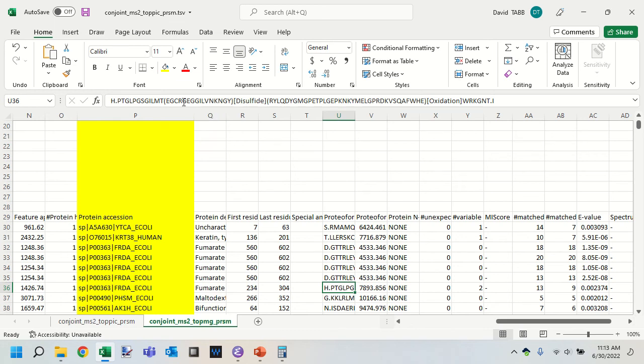So I'm going to say that there are probably going to be some changes to these localizations in how they're reported within TopMG. I think that TopPIC, being kind of the named tool that TopPIC Suite is named after, gets a lot more attention on its PTM recording. And I know that they did a lot of work on it when they moved to version 1.5 from 1.4.